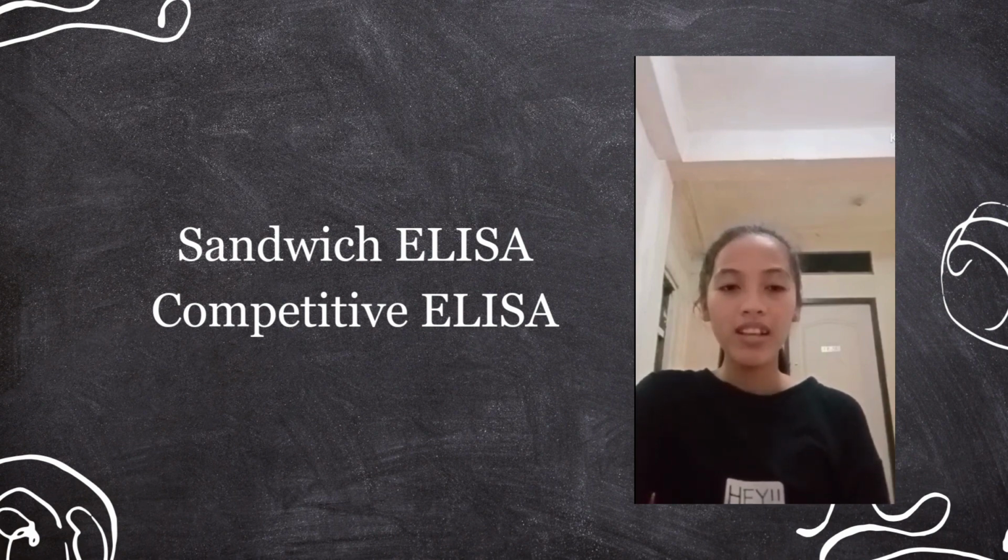In a sandwich ELISA, the target protein or antigen is captured between two layers of antibodies. The process involves several steps. First, coating. The first step is to coat the surface of a microplate with a capture antibody that specifically binds to the target protein or antigen.